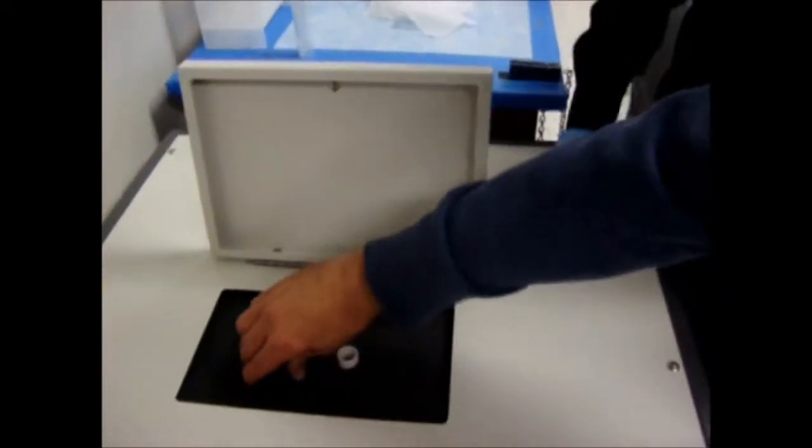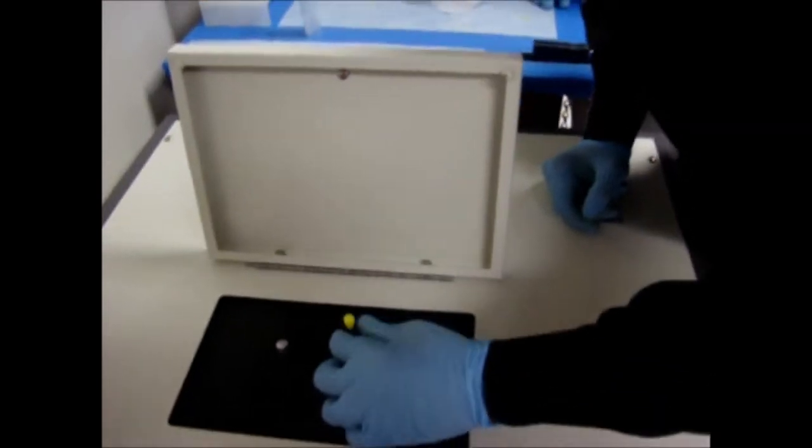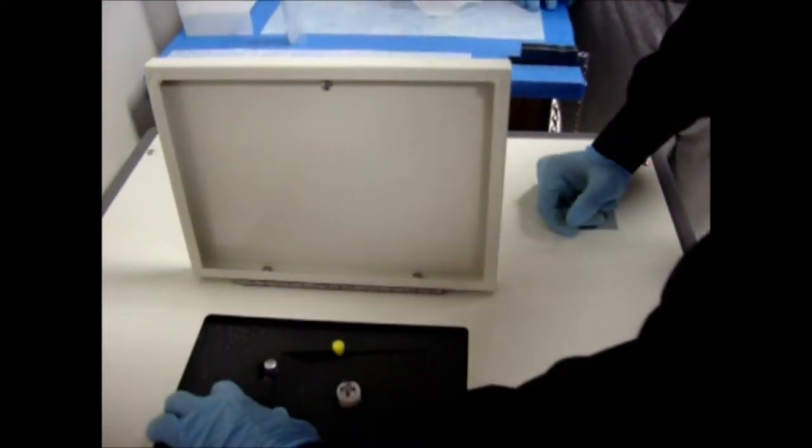So now, we put this in our NMR. Yeah, you want to turn it this way, and then, yeah. Turn it halfway over and then the rest of the way.